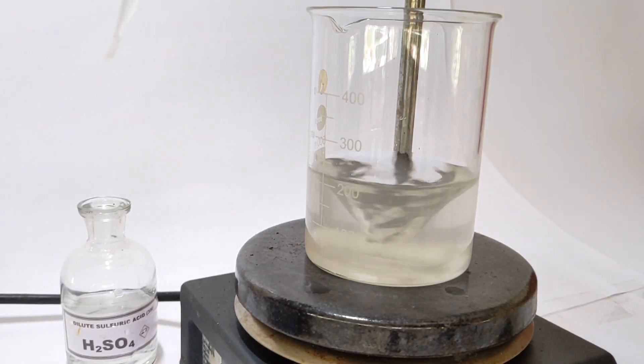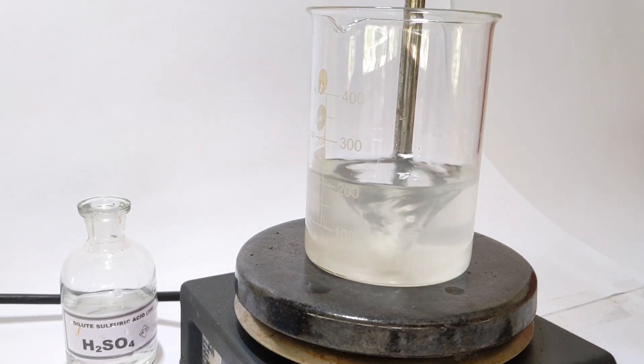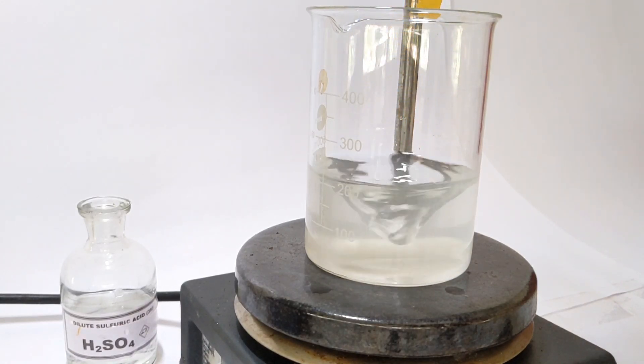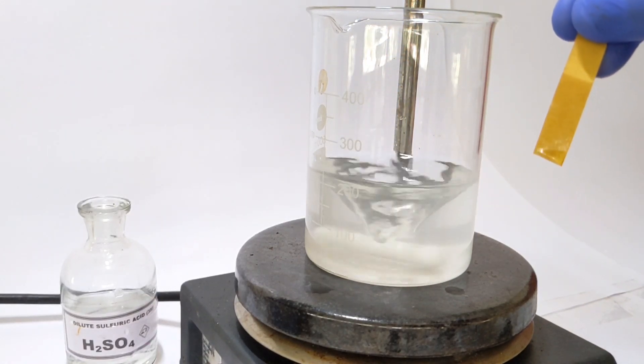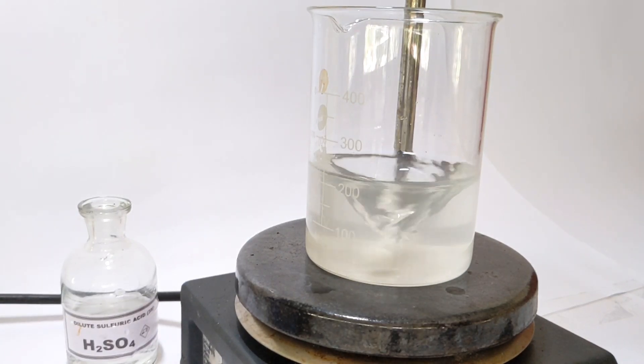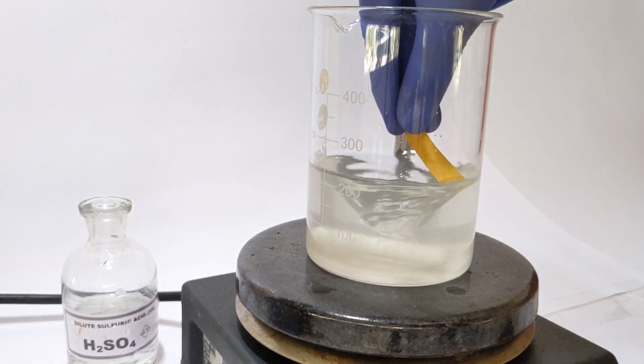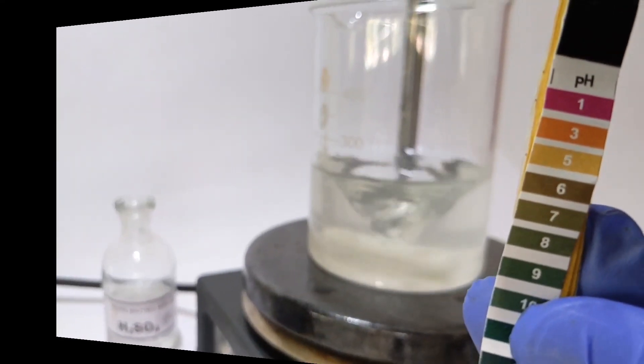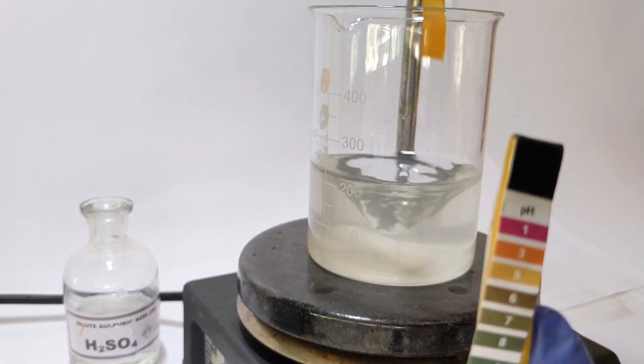A pH paper was used for that. Initially you can see the pH paper does not have any color change, indicating the pH is around 7, so more acid was added. Now the pH paper shows an orange color which is approximately around 4. You can very well see that comparison with the color chart.